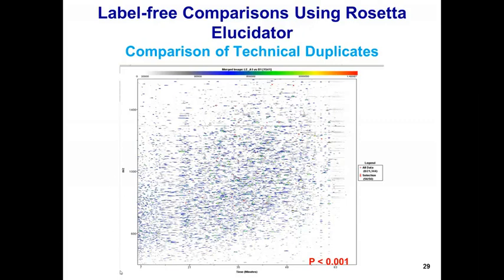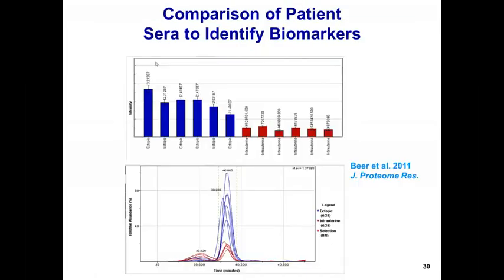The data that's actually being compared are these two-dimensional signals as shown here. The x-axis is retention time, and so this is the reverse phase HPLC separation, and at each specific point in the chromatogram, the masses over charges are plotted over the range that has been acquired. The signals are all the ions that are detected. The intensity of the signals are color-coded as indicated at the top.